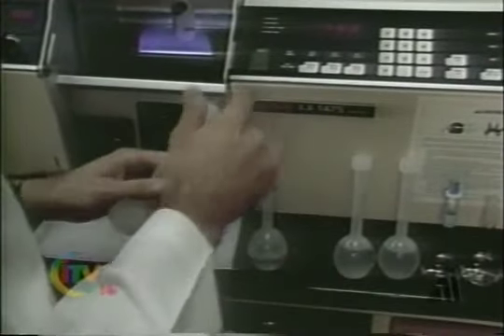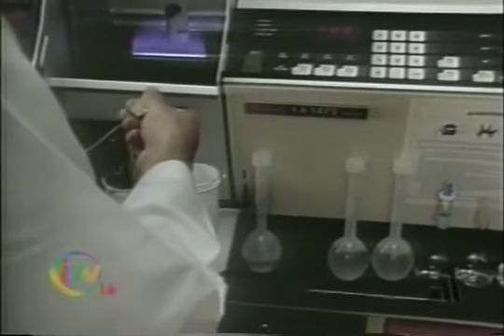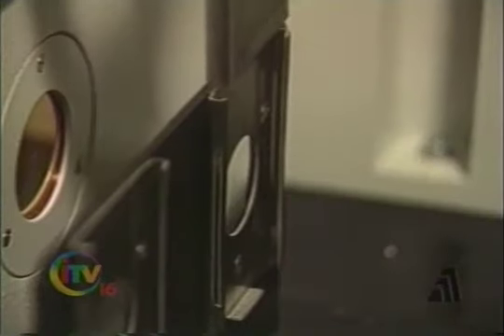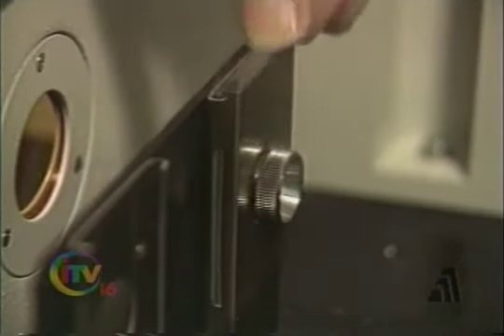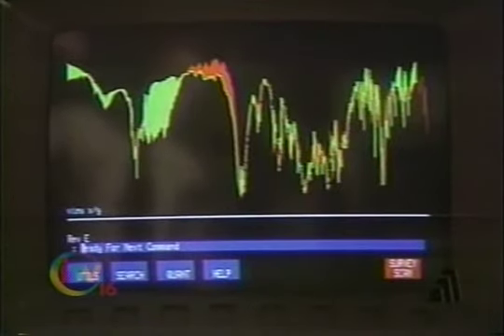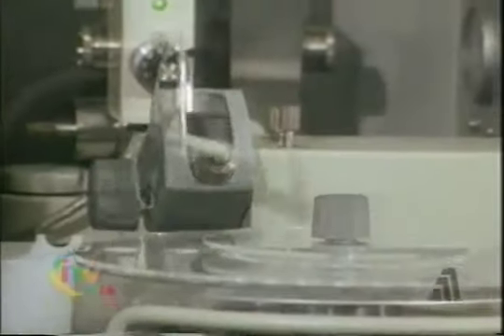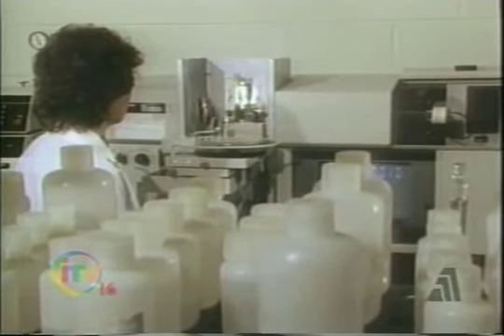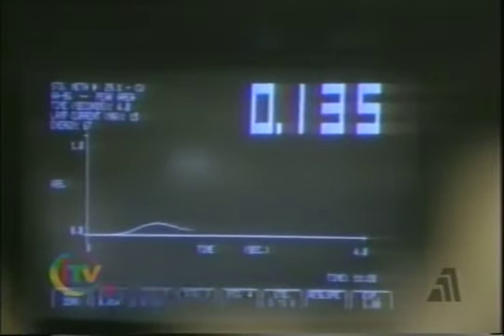Probing matter with electromagnetic radiation is the basis of the analytical technique known as spectroscopy. Any substance can be examined spectroscopically, and many different forms of radiation can be used to analyze it. The key principle underlying spectroscopy is the interaction of the radiation with the material being analyzed. In order to understand the interaction, you have to know something about electromagnetic radiation.